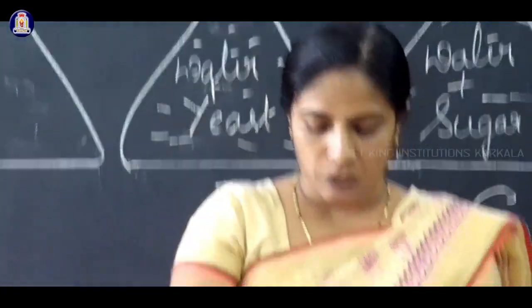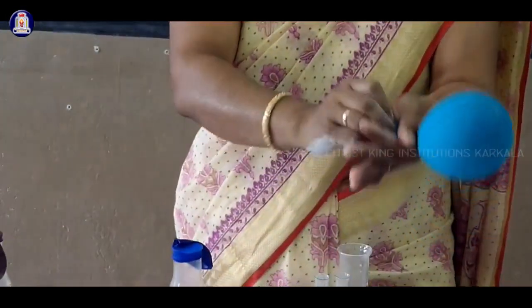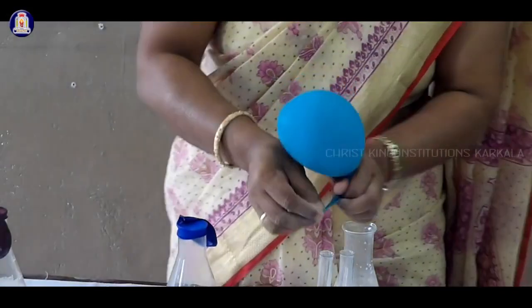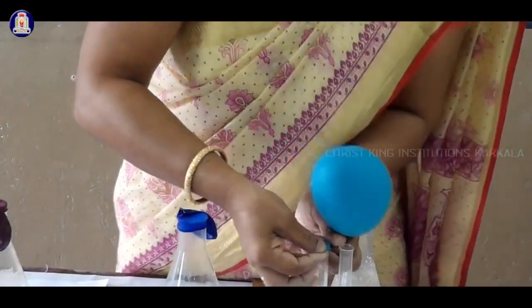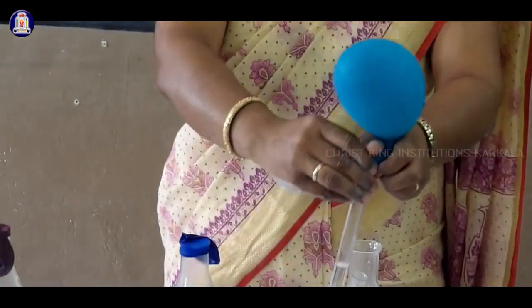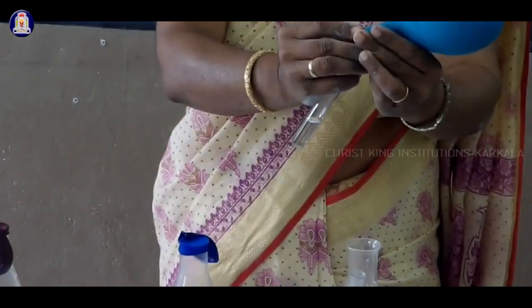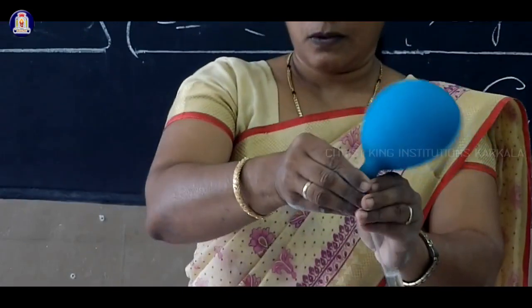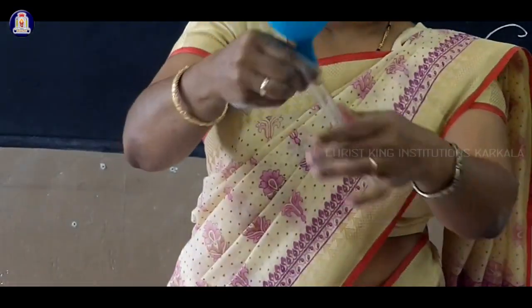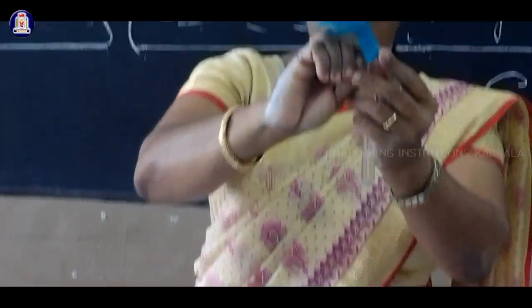I will fix this balloon to the test tube, to the lime water I have already taken in a test tube. What will be your inference? Slowly you have to fill it, because it is already carbon dioxide. So I will fit this balloon to the test tube. Now observe carefully.